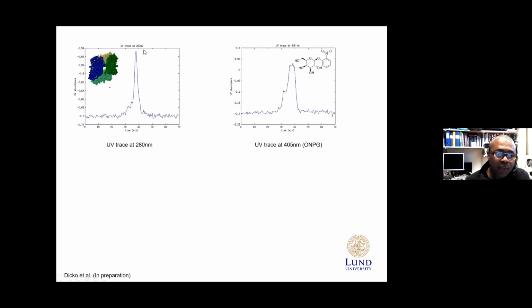And here you would say there is only one big fraction and maybe a shoulder here. And what happens is that there is a big fraction that has a certain reactivity, but also the shoulder has some reactivity. So if you were to take this particular enzyme and measure it immediately, you will have a mixed reactivity from the main component and something else.